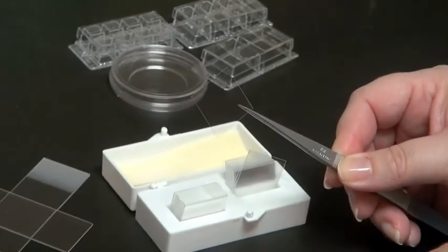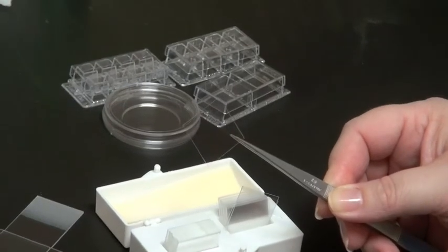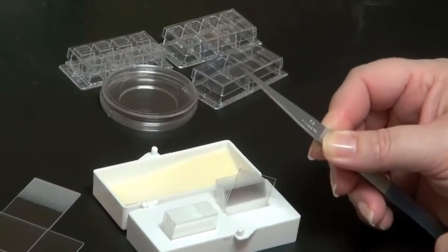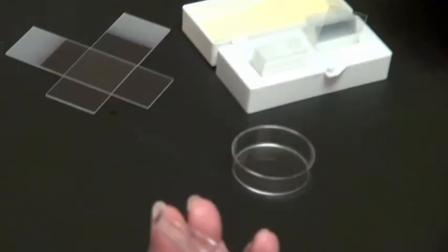You want to sterilize these so you would dip this in ethanol and then flame sterilize. Once it's cool you simply lift off the top of your petri dish and deposit the cover glass.